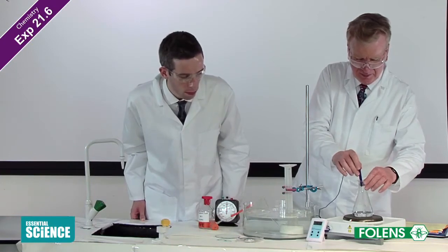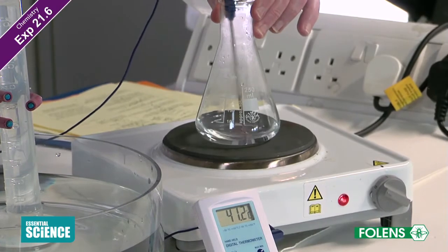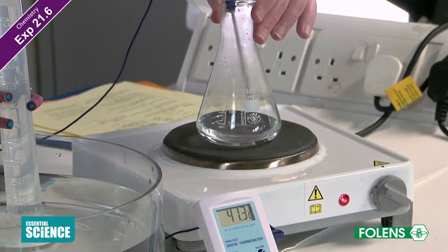Repeat the experiment, but this time warm the hydrochloric acid in the conical flask to about 40 degrees Celsius on a hot plate before adding the magnesium metal.